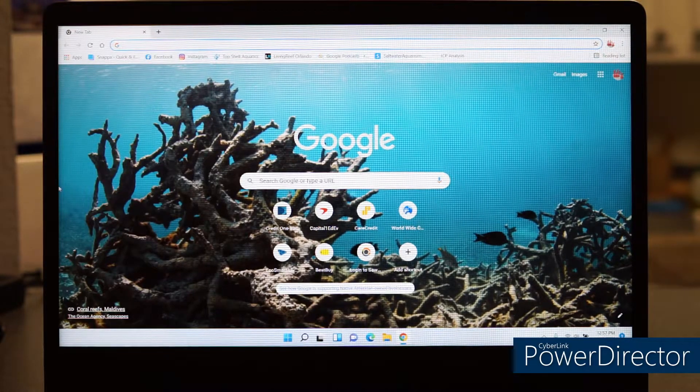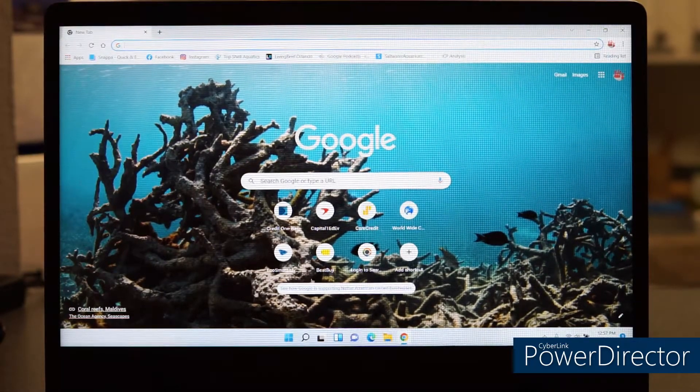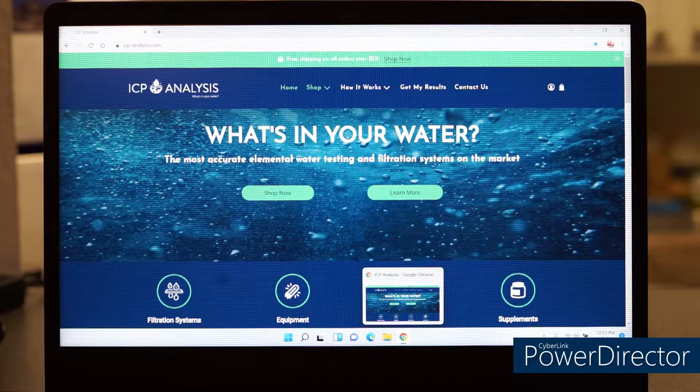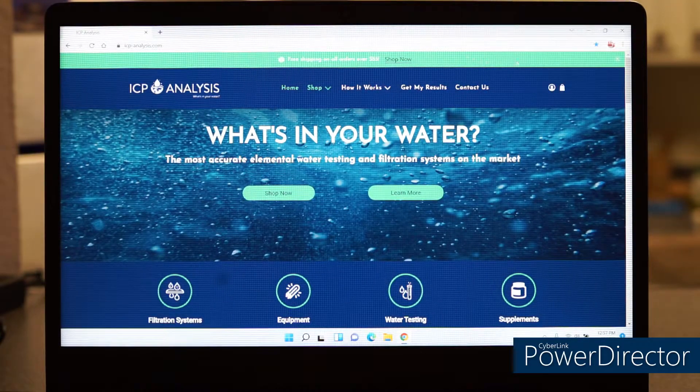Here we are in front of the laptop under Google Chrome. I made the site a bookmark. This is the first screen you're going to get. You do have to go ahead and create an account with them. You'll see this screen first, and then on top you're going to click 'Get My Results.'